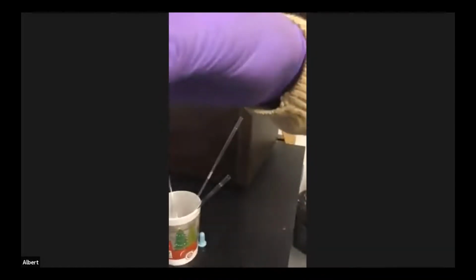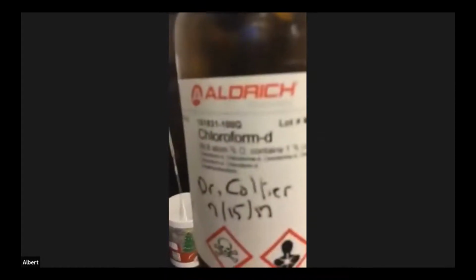Wow. So I'm going to make up the first sample. When you do NMR, you have to do NMR in a deuterated solvent, right? So this is, let me get that on there. This is deuterated chloroform. Let me go back. All right, deuterated chloroform.